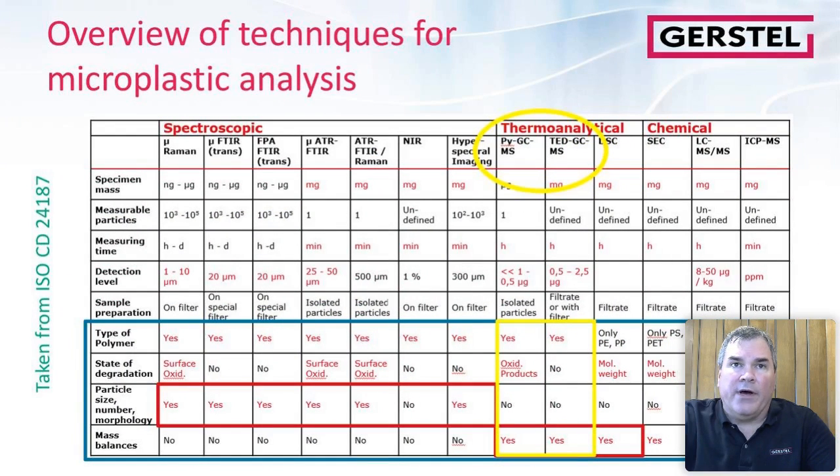Consequently, there are other ways of looking at microplastics. The spectroscopic ones are valuable, but we're going to spend time talking today about thermoanalytical methods, pyrolysis, and this new technique called thermal extraction desorption. These are other ways of doing this.